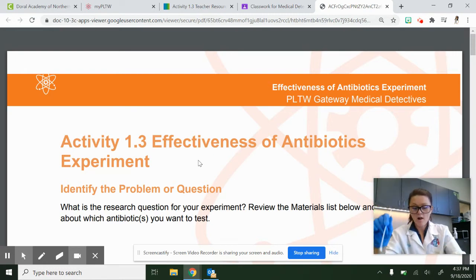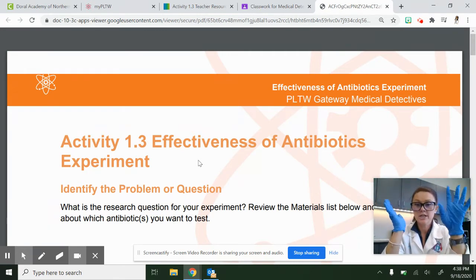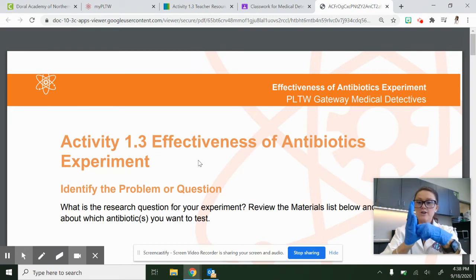That part's done. So this, partner, that was your job. So your job is done and you can go ahead and dispose of all of your materials. So throwing that away. To remove your gloves, you're going to take one hand and you're going to pinch these gloves and you're going to pull these up, okay? And then you're going to take this hand, okay, and pull it off.